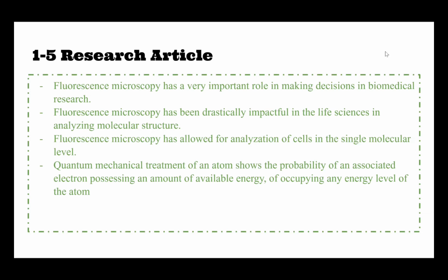A research article by John Daniel titled Advanced Fluorescence Microscopy Techniques for the Life Sciences mentions that fluorescence microscopy has a very important role in making decisions in biomedical research, and that it has been drastically impactful in the life sciences for analyzing molecular structures. It has allowed for analysis of cells at the single molecular level, and quantum mechanical treatments for an atom show the probability of an associated electron possessing an amount of available energy of occupying any energy level of the atom.